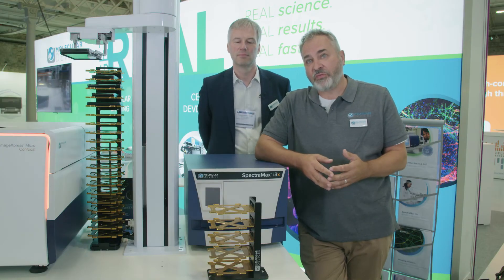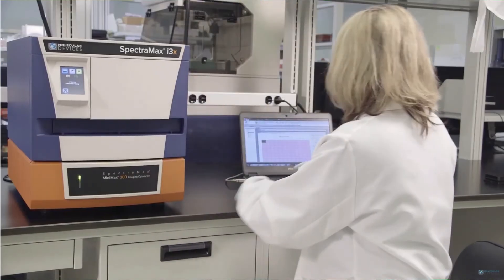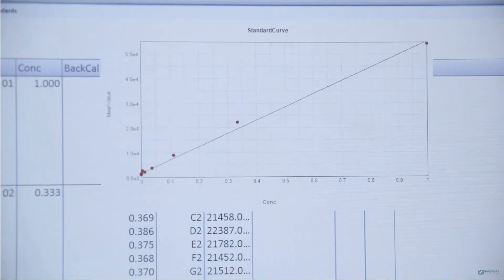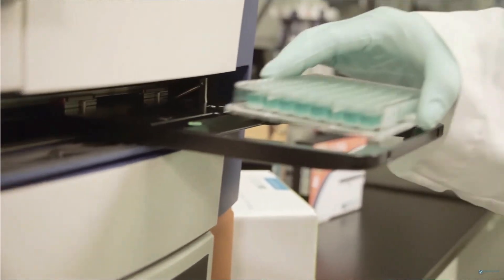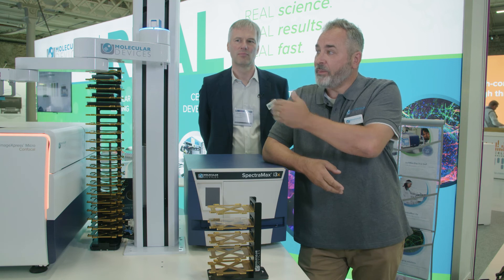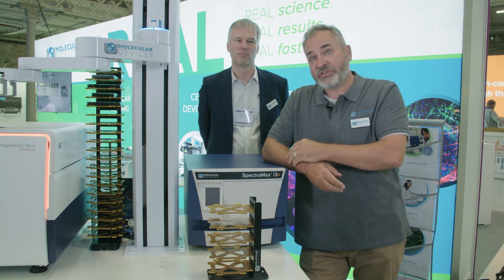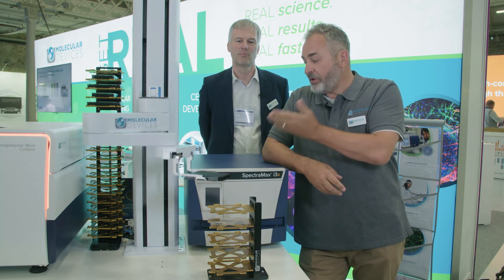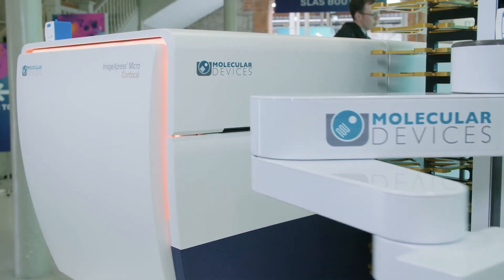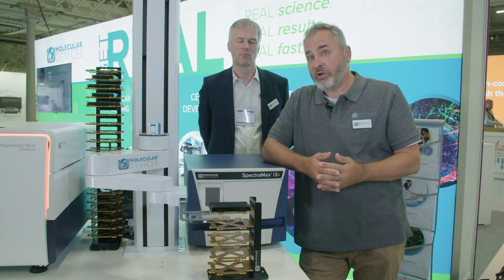With the i3X, we offer SoftMax Pro data acquisition and analysis software. This software is used across all of our microplate readers and is used by researchers across the globe. We also offer automation systems, as you can see here — in this situation, we have an i3X, Minimax, and a confocal imaging system working together, providing you a high-throughput workflow.